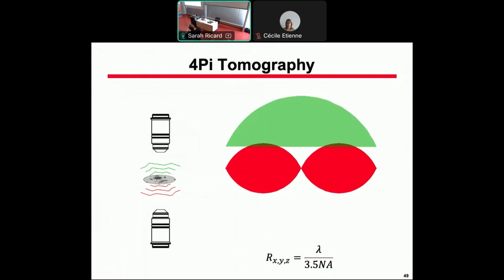And if we now switch to a symmetric system, in transmission, we will measure the same, but we get the reflection back here, and we will have this. And the trick will be to recombine everything. So here I'm cheating a bit. This is a computation of the components made for 1.45 numerical aperture objectives, which are not so common. They are used in total internal reflection fluorescence microscopy. With 1.4 numerical aperture, unfortunately, this overlap here does not exist anymore, which means we will have a problem.